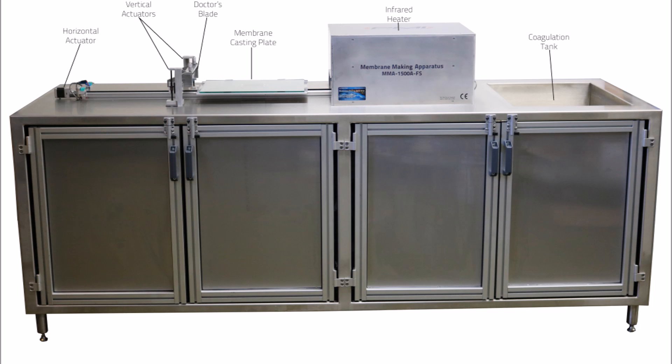Here you can see a basic layout of the machine. From left to right we have the horizontal actuator, doctor's blade, vertical actuators, the membrane casting plate, infrared heater, and the coagulation tank.